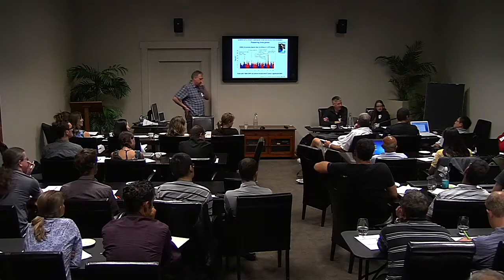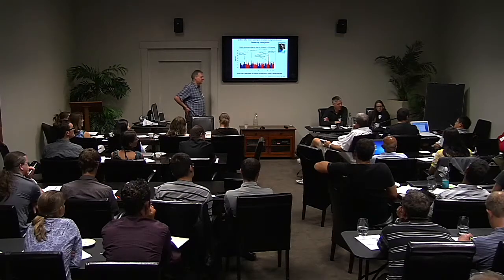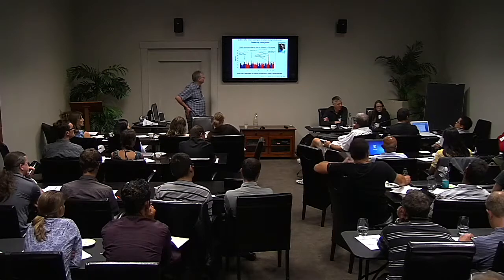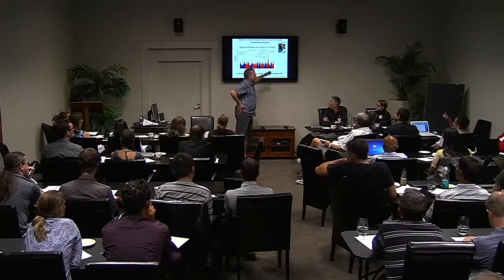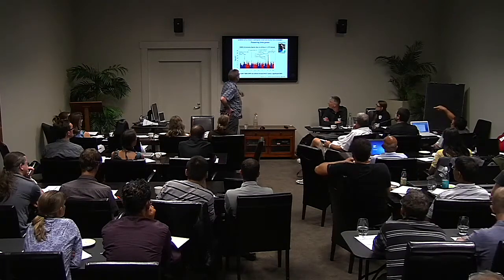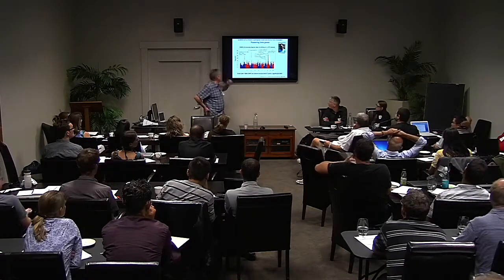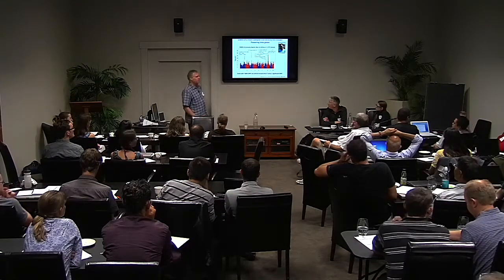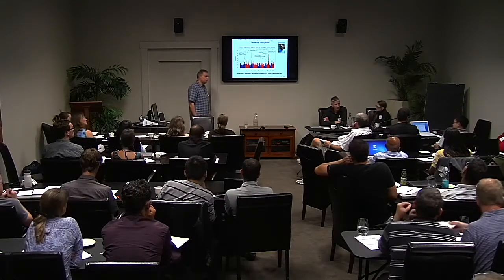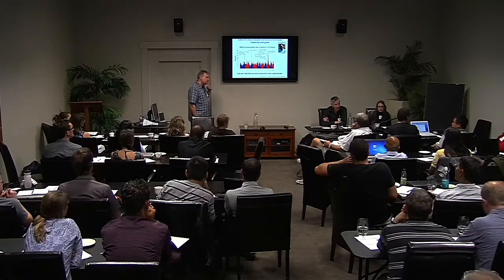So, our second question: if you think that one is a true positive, the second one is a huge difference from the first one. Like this one? The drop-off in the p-value, you mean? There's a 10,000-fold difference. Oh, yeah, because this is a log scale. And you generalize the criteria for a positive call. These are real markers.